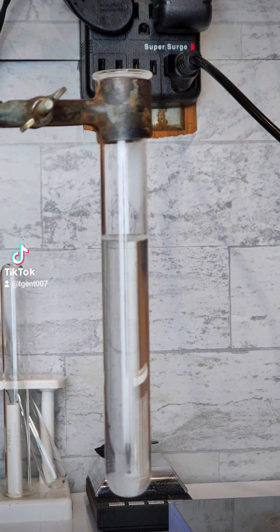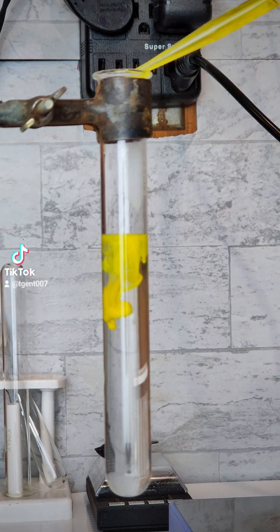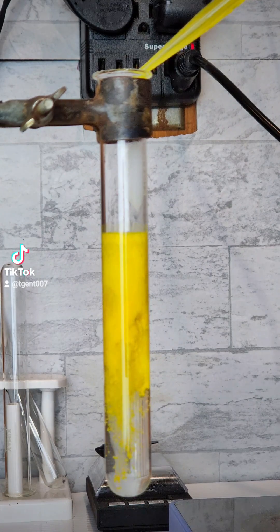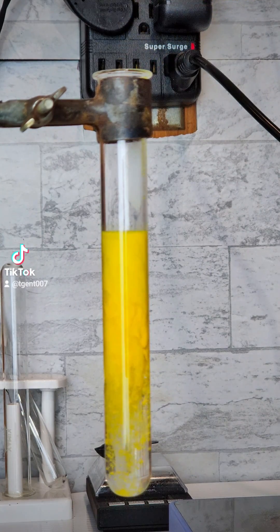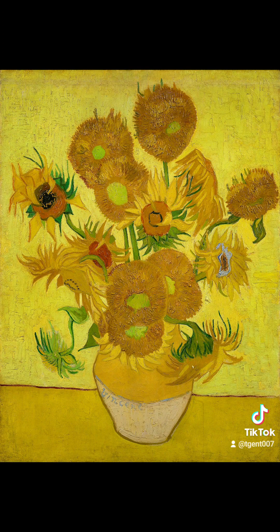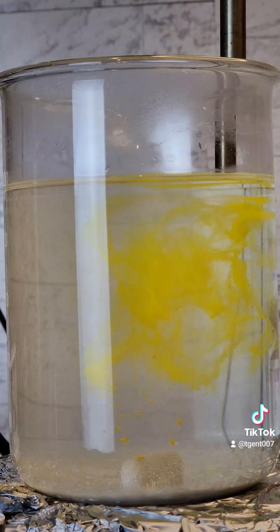Now that it is reasonably dissolved, all I need to do is add the sodium dichromate solution to the lead nitrate solution, and the lead chromate will precipitate out. Lead chromate is more commonly known as Paris Yellow or Canary Yellow, and was common in oil paints. Sunflowers by Vincent van Gogh primarily uses this pigment. Anyway, let's make the rest of it.